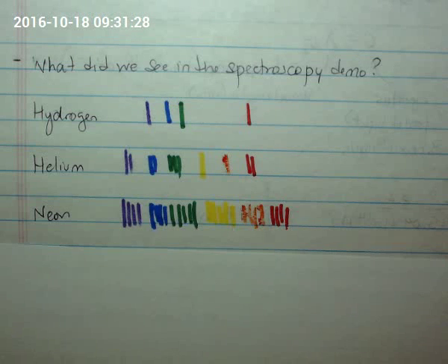All right, so the other day in lab, what did I do? I set things on fire, right? I turned on a Bunsen burner and I threw a bunch of salts in them, and depending on the salt that I put in, you got different colors that came out, right? And then I said to you, it would be a real pain in the butt to sit there spraying those salts into the Bunsen burner long enough for me to really measure all the lights. So it might be better for us to study elements that you could contain in a tube.